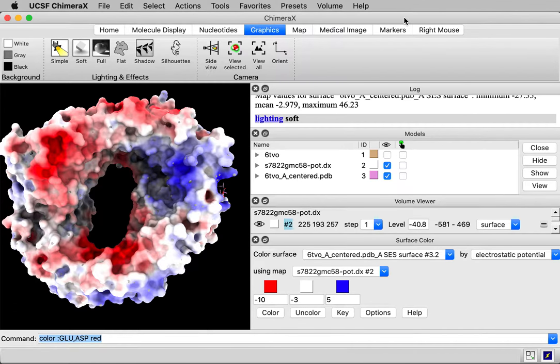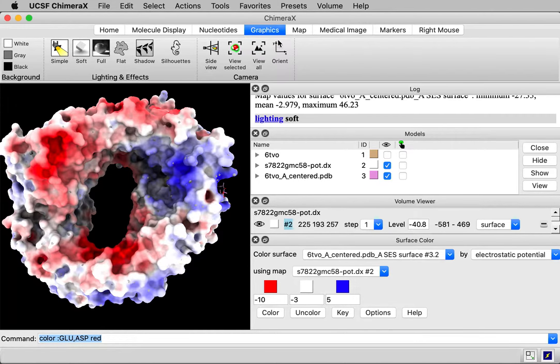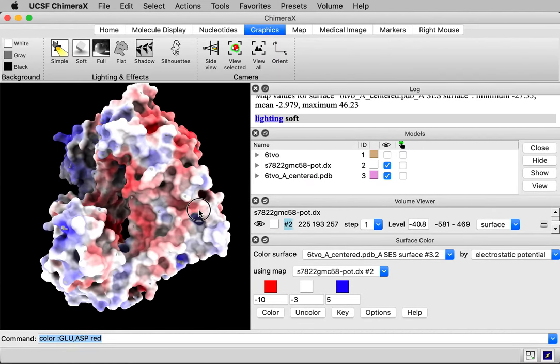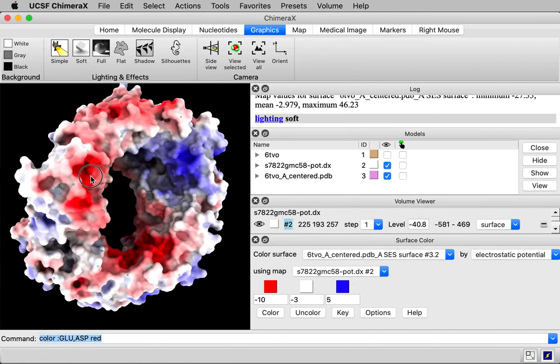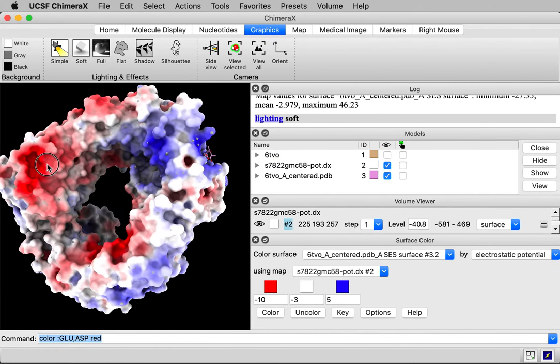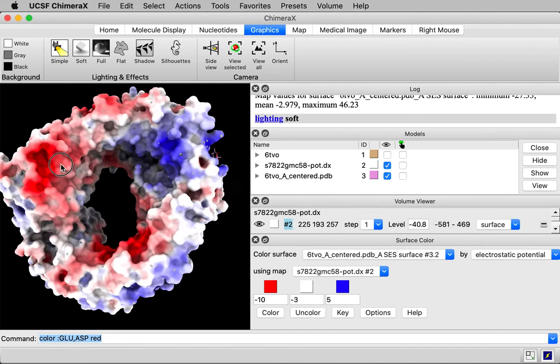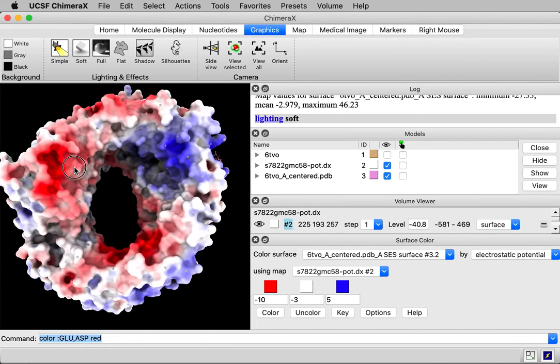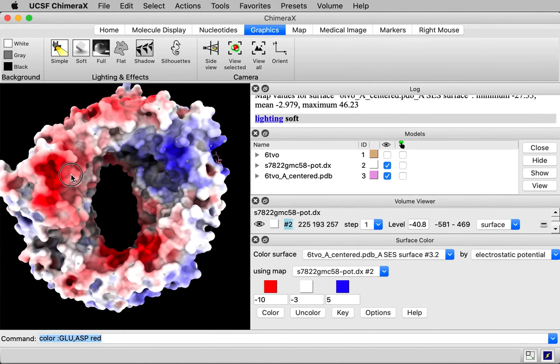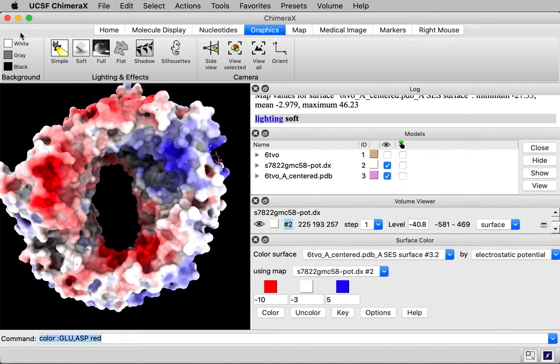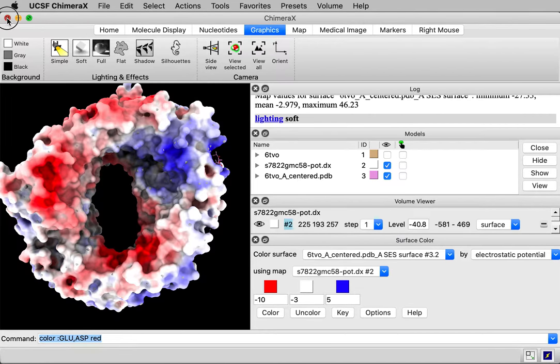Let's take a look at how to color a protein molecular surface by electrostatic potential. Here's the kind of coloring we're going to get. Red is negative potential, blue is positive potential. I'm going to quit this ChimeraX and start from the beginning to show how to do the coloring.